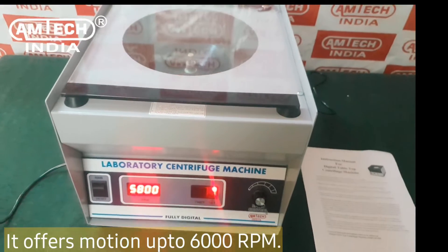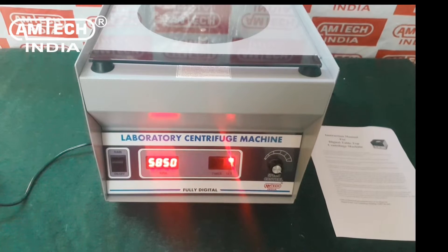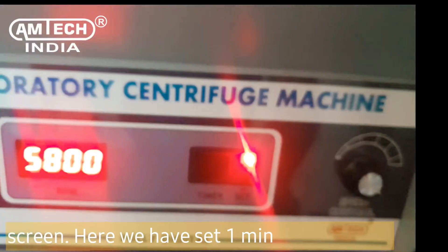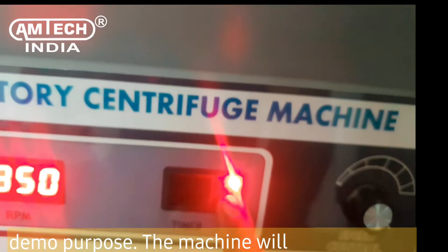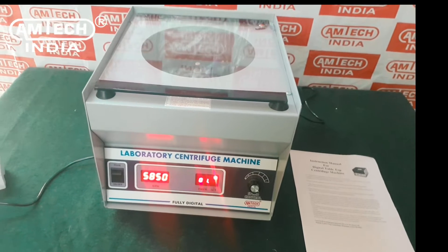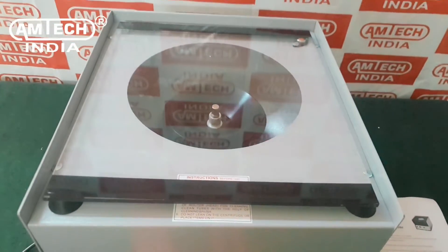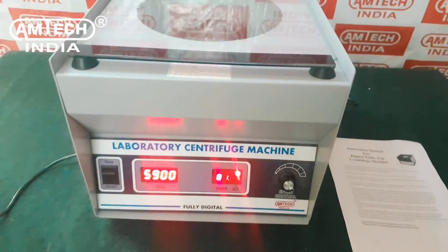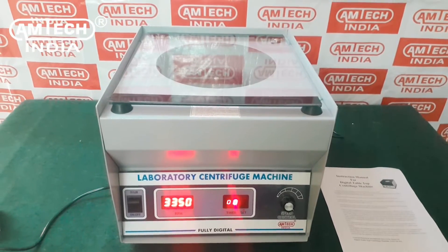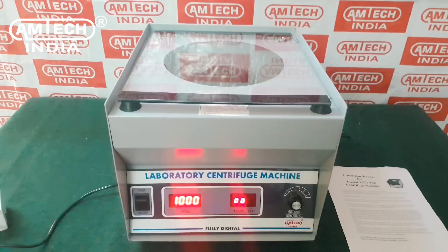It offers motion up to 6,000 RPM. To set up the timer, press the set button on the timer screen. Here we have set a one-minute timer for demo purpose. The machine will automatically halt the operation after its set time.